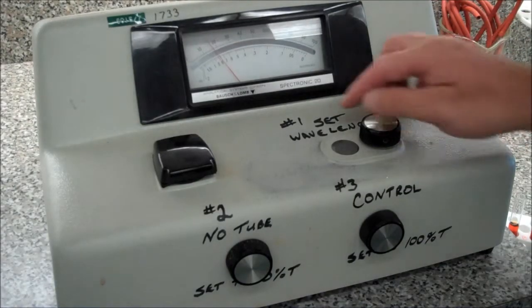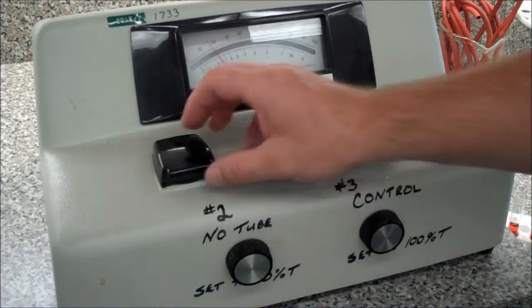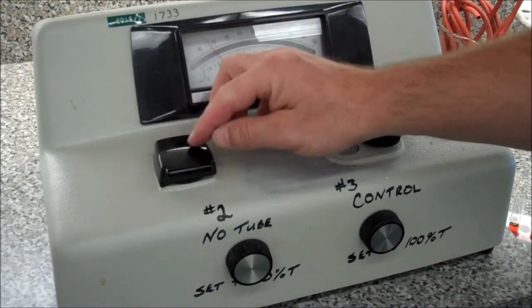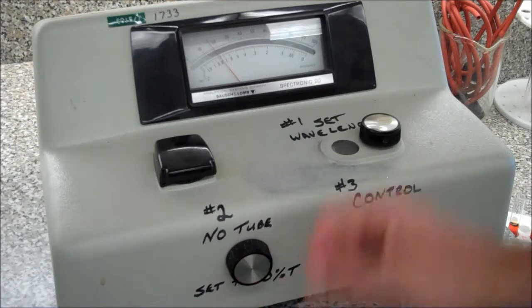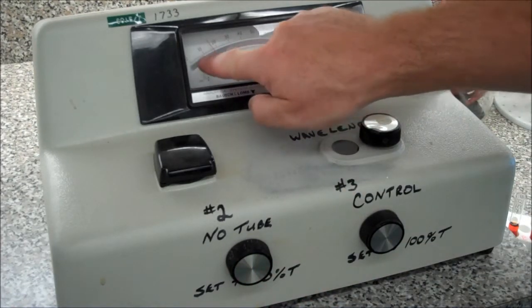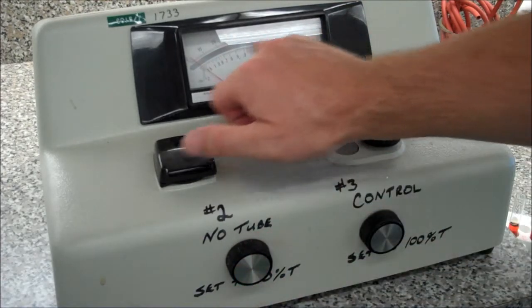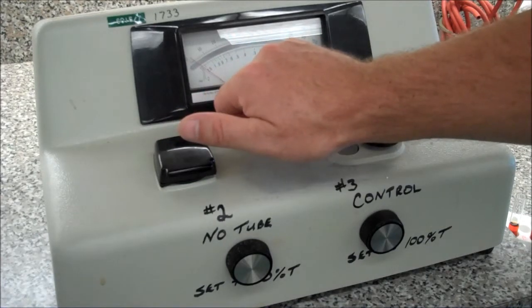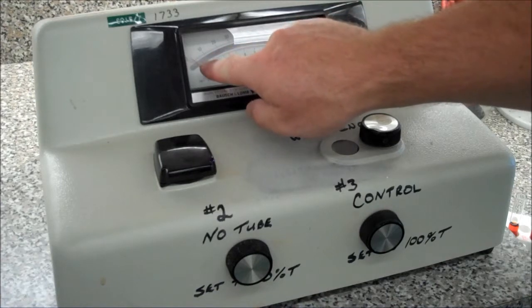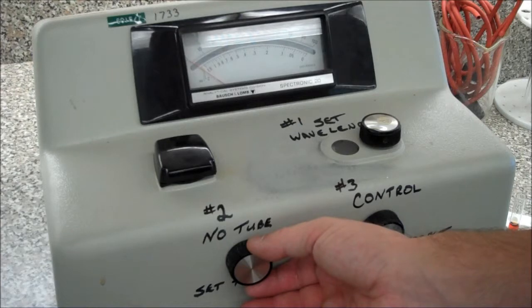Now, in setting up the machine, we've already set the wavelength — notice it says number one, set the wavelength. Number two says, with no tube — here's your sample chamber, so there's no tube in there — with no tube, set to zero percent transmission. So on this scale, the top scale says percent transmittance. I'm going to set it to zero. When reading in an analog instrument, there's a mirror in the background. The reason the mirror is there is so that you can read the image of the needle in the mirror, as opposed to looking at the needle itself. So I'm setting that to zero.